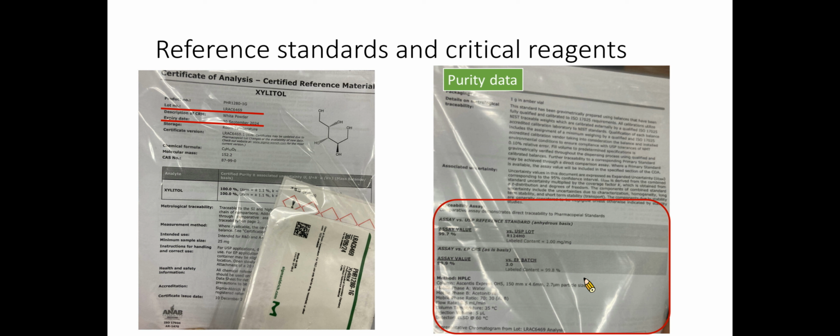If the reference standard expires, you should not make stock solution with this lot of standard unless the standard's purity is re-established. For internal standards, you do not have to provide a COA or evidence of purity if it demonstrates that the IS is suitable for the specific use, like a lack of interference with the analyte.